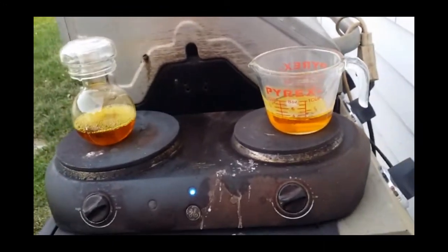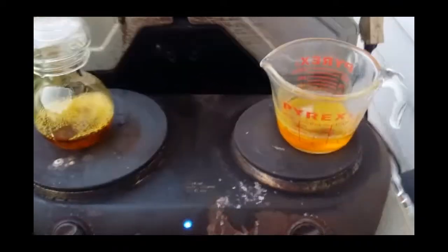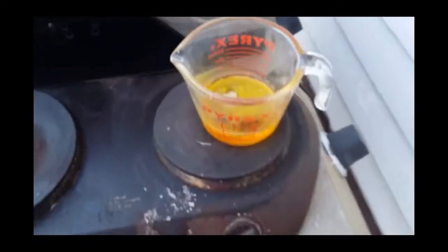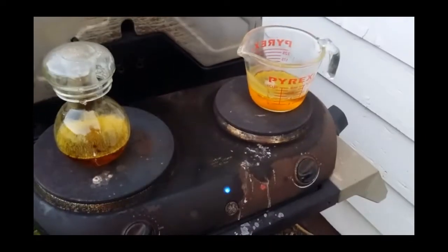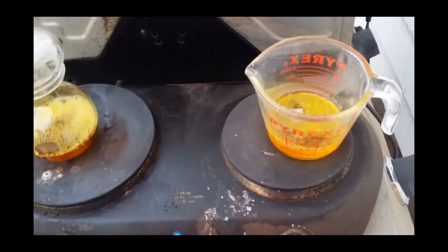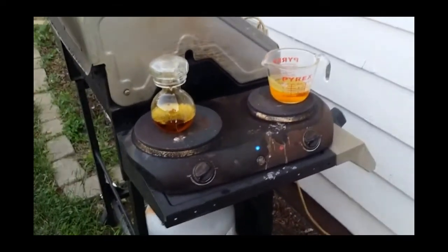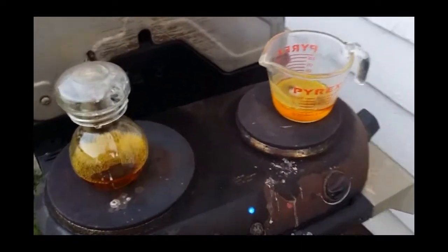Since this is about my third time trying to evaporate this to destroy the nitric, I've noticed that it keeps crystallizing some white solids. Usually I would guess that would be lead, but a little bit of research, that might be tin. Could be lead as well. That's what I always assumed. But I guess tin chloride, because of the hydrochloric acid, could cause the same issue as lead chloride. But this was relatively pure gold I was working with.